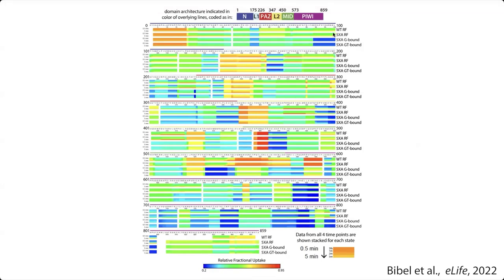You also see that we used this 5XA, the version with alanines in the place of those phosphorylatable residues. You can see here that with the wild type, we weren't even able to get data for the eukaryotic insertion, probably because it was too heterogeneous. It could be that the protein had some phosphorylation on it. Even though we tried to dephosphorylate it in vitro, it still could have some phosphorylation, things like this, that made it so we couldn't detect this.